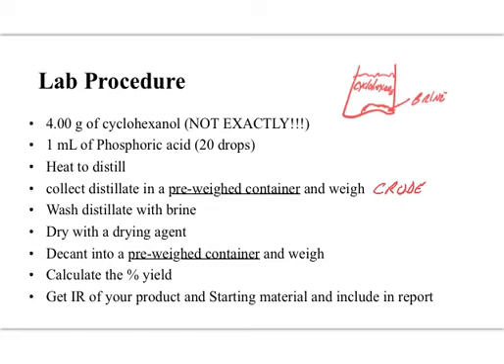Okay, then we're going to throw in some drying agent. Not a ton of drying agent. I don't know which drying agent they're going to leave out. Some of the common ones that we've used, sodium sulfate, that's an easy one to filter from, so I'm hoping we have that present. Or the other drying agent is magnesium sulfate.